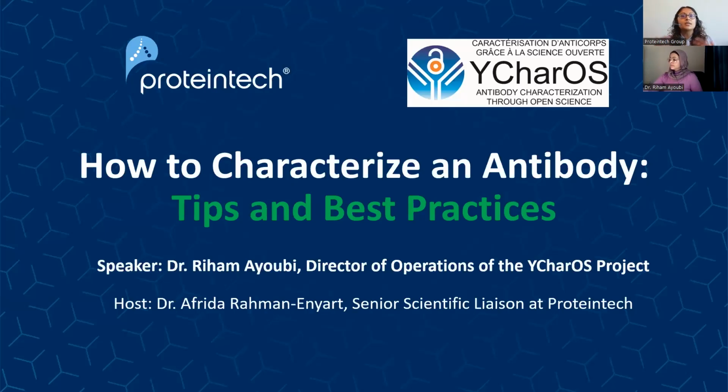And I think this is a really important topic to cover considering the reproducibility crisis and the fact that dirty reagents can really affect your data and ultimately the conclusions that you draw from your findings. So Dr. Ayoubi will be sharing with us some best practices for helping ensure that the reagents that you are using in your experiments are top quality and can give you reproducible results.